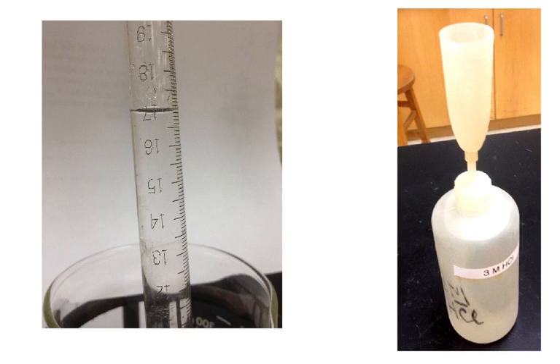Next then, we want to take our gas collecting tube, a eudiometer tube, and you can see that the numbers are upside down, and that's because we are holding this upside down like a giant test tube. So the open end is up this end, and the closed end is down this end.